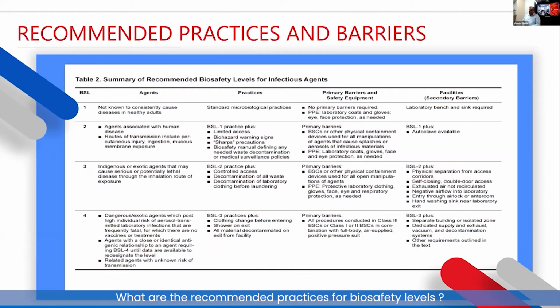Entry into the lab is only through airlocks and entry rooms, and then there necessarily has to be decontamination of hands or whatever is used while handling the biohazard.